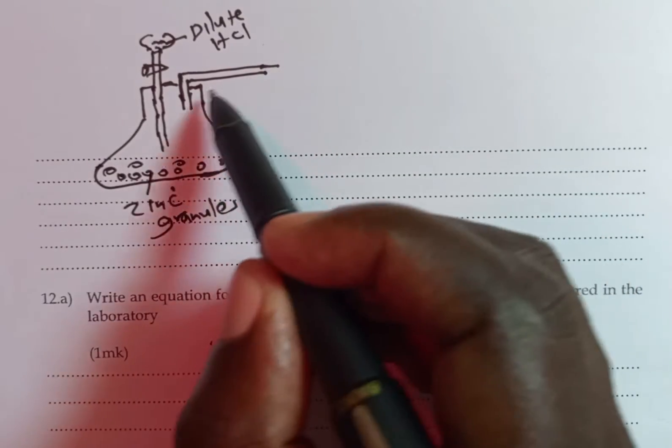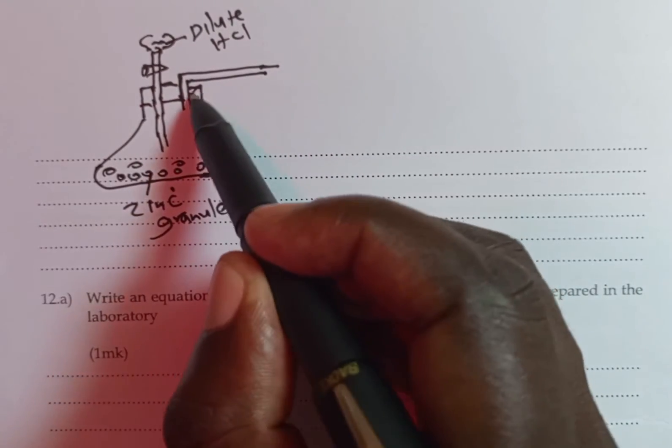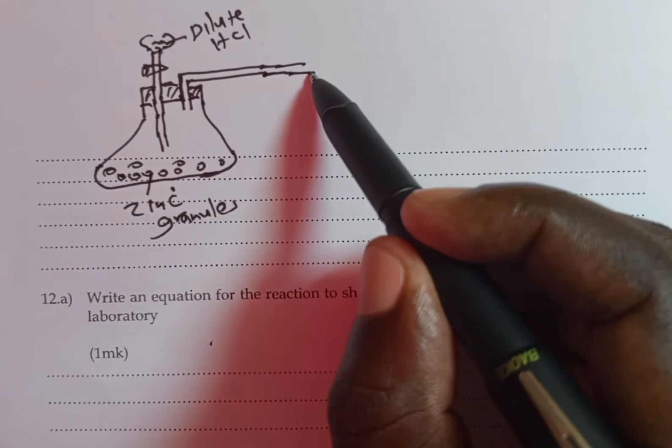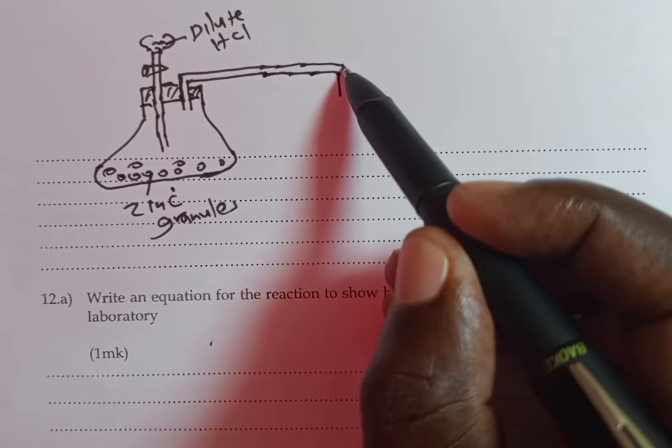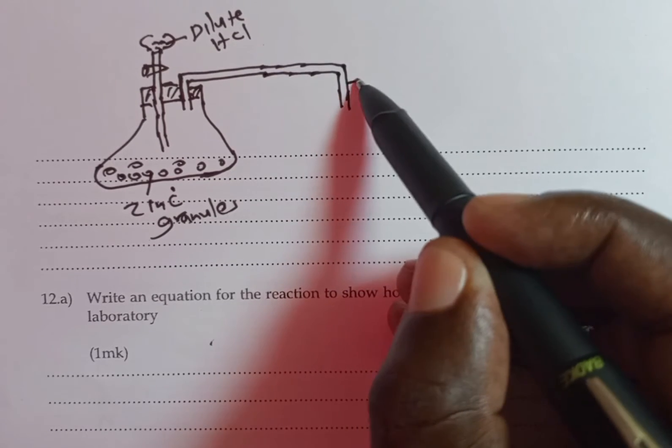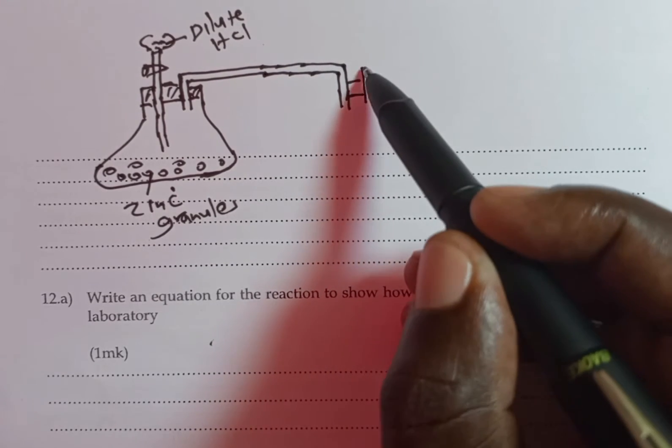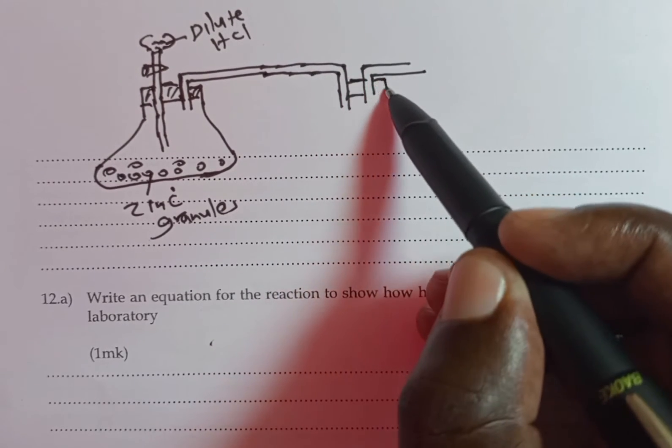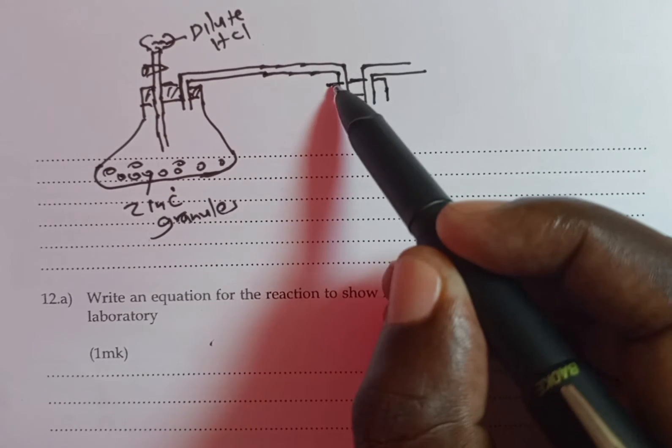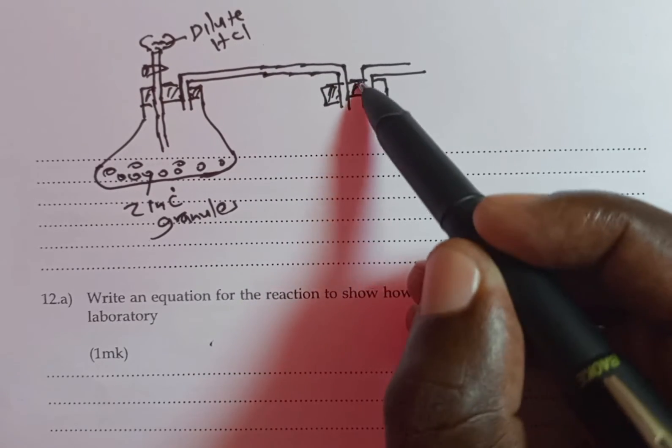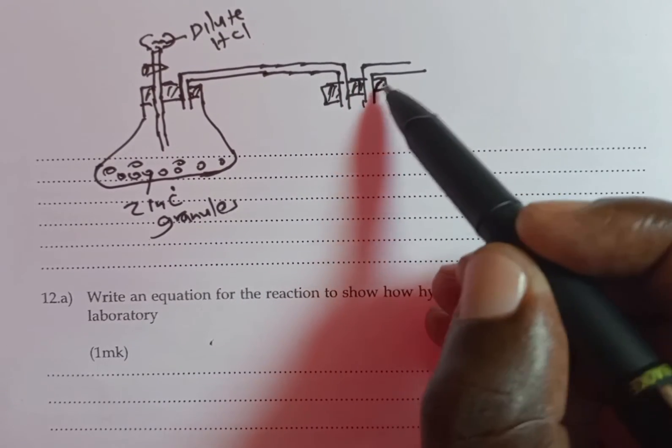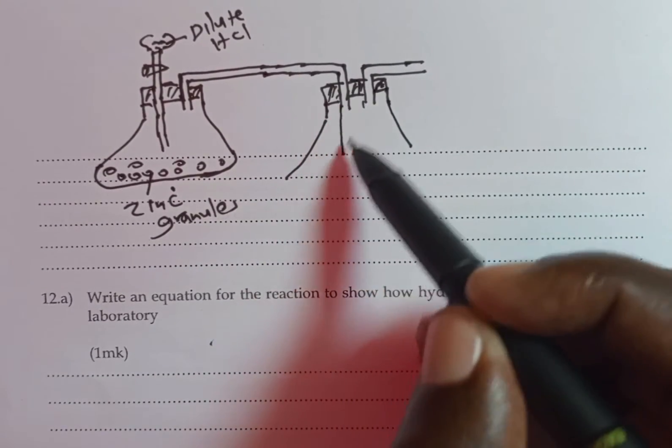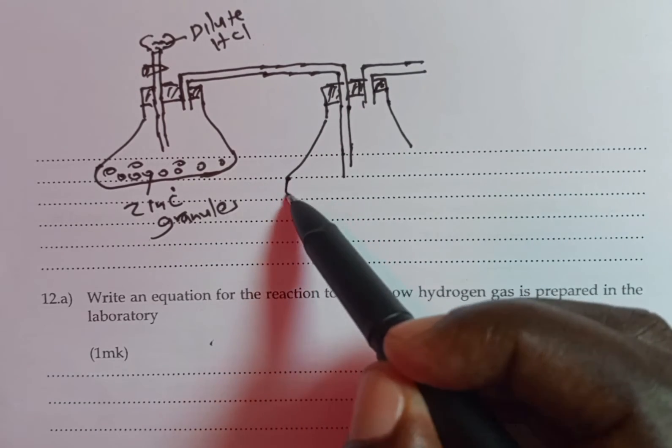From this reaction vessel, we have the delivery tube that will direct the hydrogen produced into the drying vessel. So this is what we have.